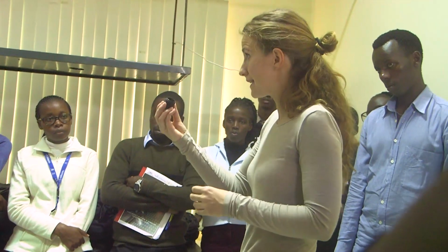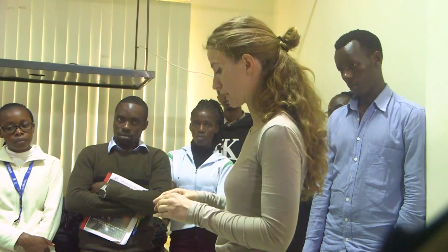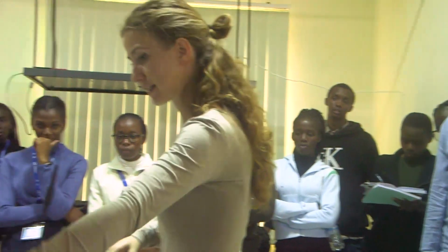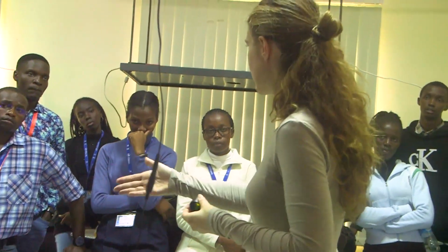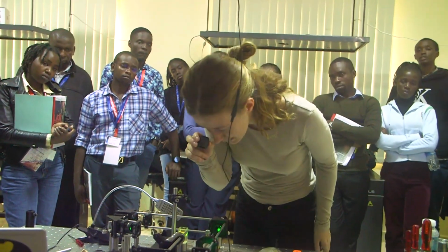filter. So it doesn't work in absorption, but works in reflection. It will reflect, in this case, everything that is below 550 nanometers, while it will let all the other wavelengths pass through. So I will use this in my detection line to get rid of the laser. But the nice thing is that if I look through it, I can see the fluorescence here.